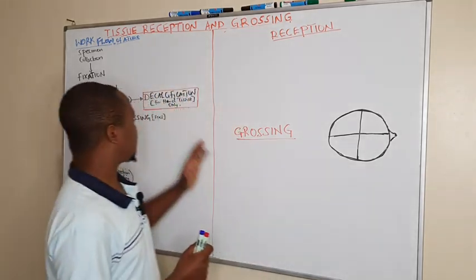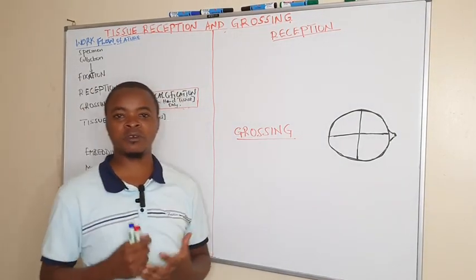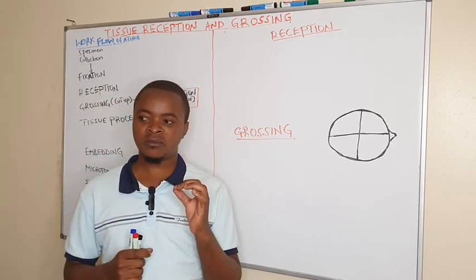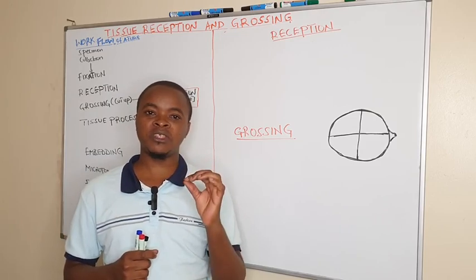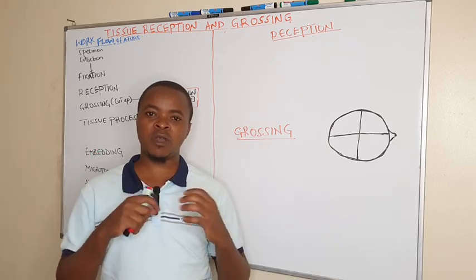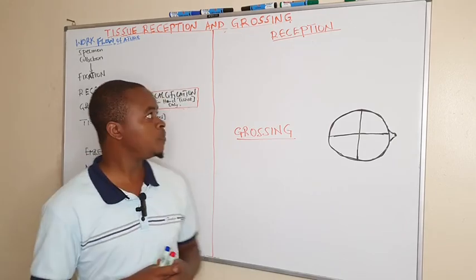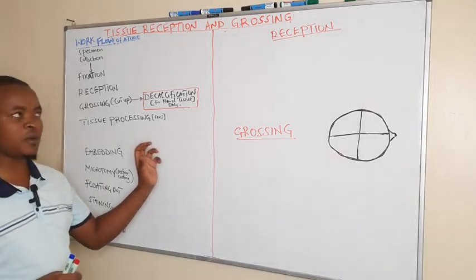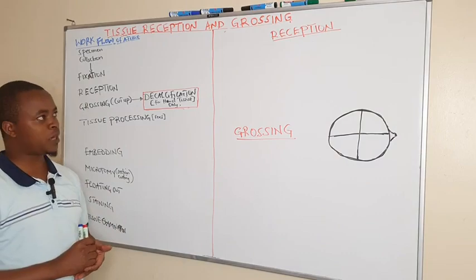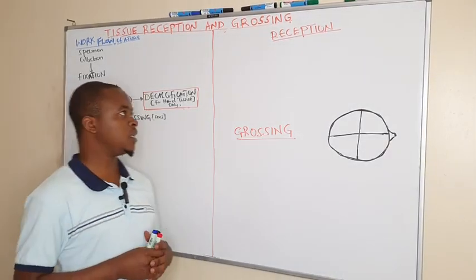So we want to look at histology, and you can ask yourself, what is histology or histopathology? Histology is the study of tissue. Then histopathology, we say, is the study of disorders of the tissue, or what we call cancerous tissues, throughout cancers and tumors. So we want to see how we process a sample for examination of any abnormality in the tissue for diagnosis of different diseases.